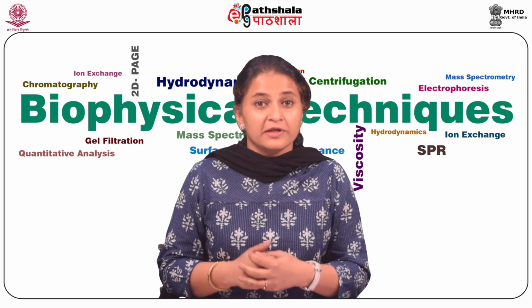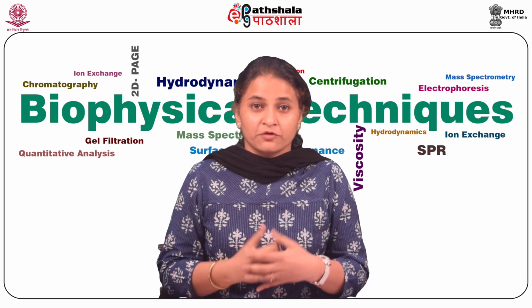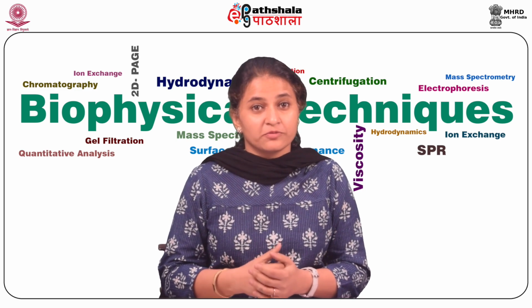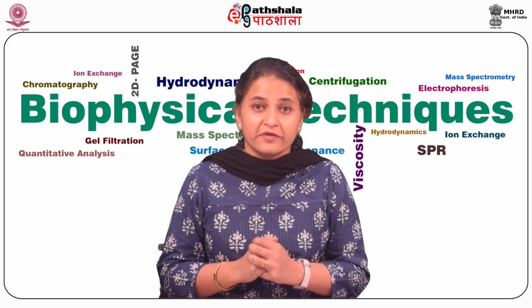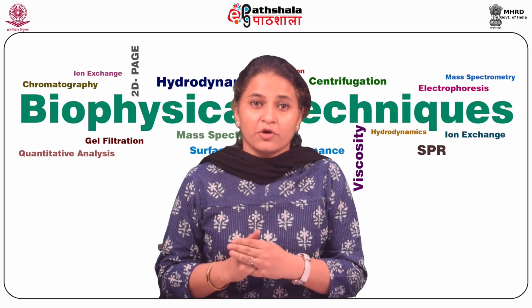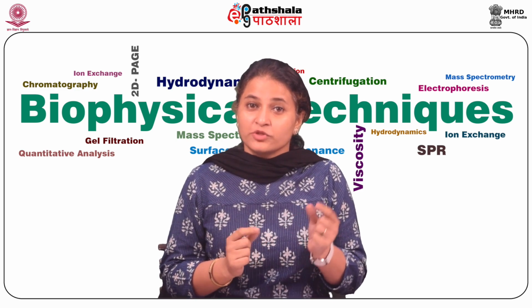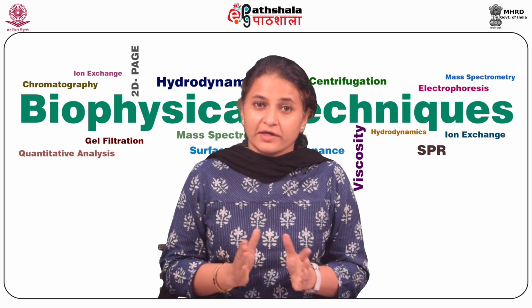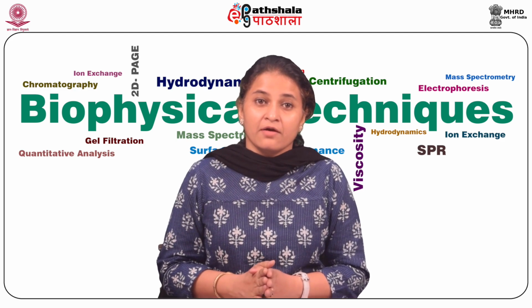Then again, the column length and diameter, which you know now range from anything between a few meters to up to 105 meters, and the diameter of the column is very critical for the GC separation process. And then the thickness of the stationary phase, which again we know can vary widely, affects GC separation in a major way.